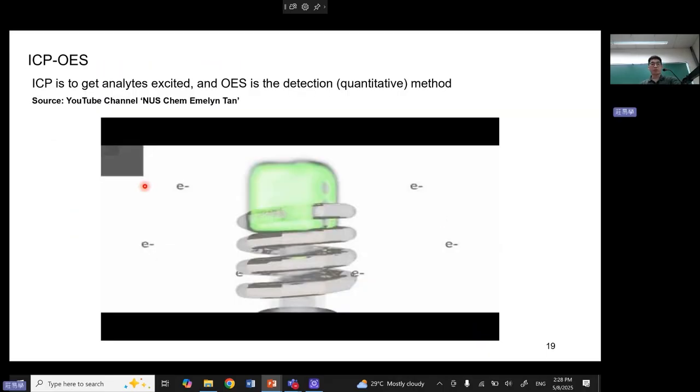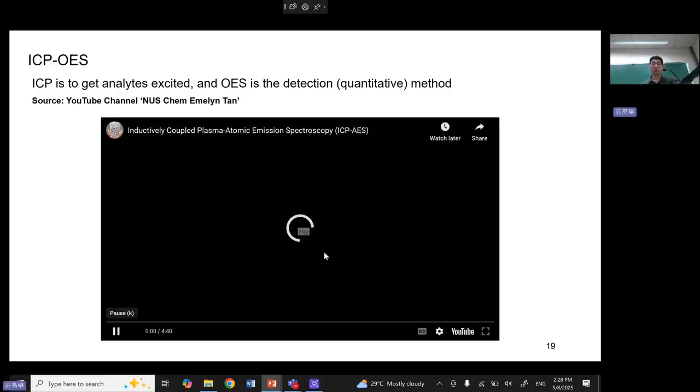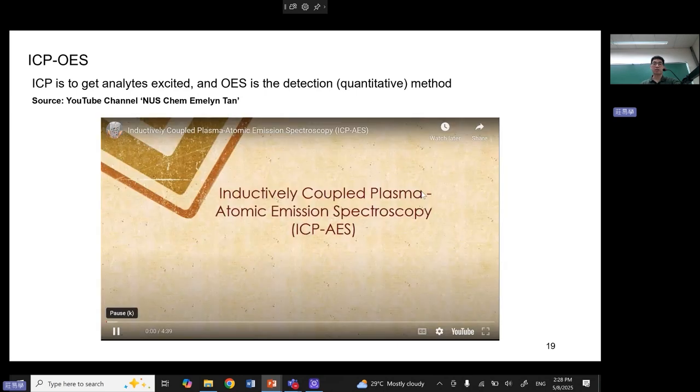So here's another video showing you how it works in ICP AES. So take a look.